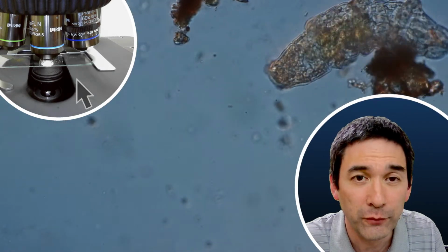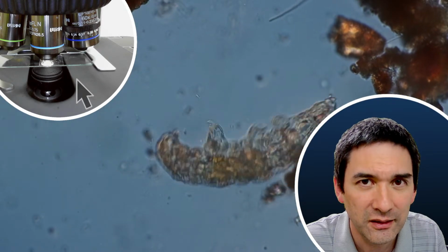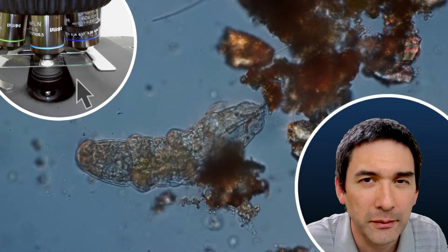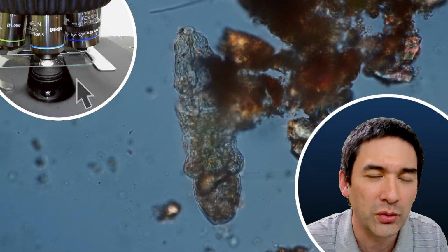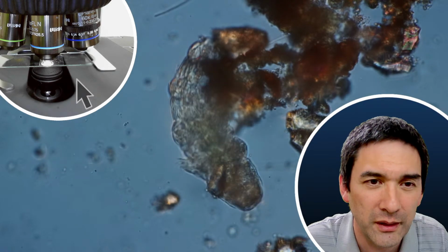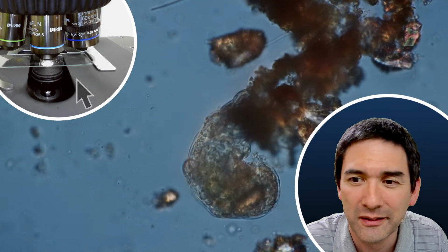So it is possible. I have done this before. It requires a very steady hand, and it's a little bit of a question of luck as well. I've done this in order to remove all of the other dirt and so on. But in the process, sometimes you also lose the specimen.